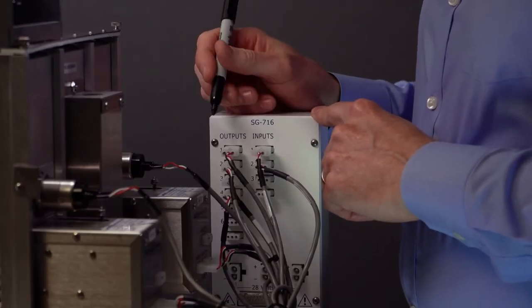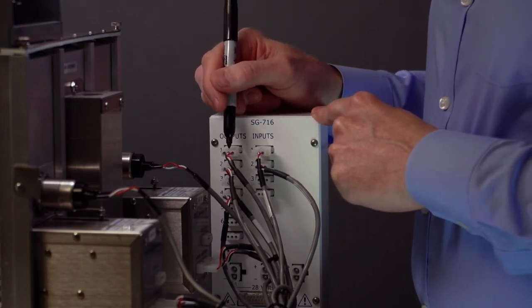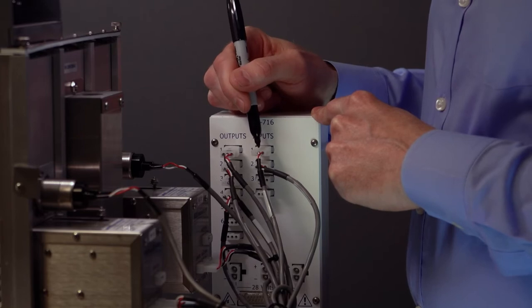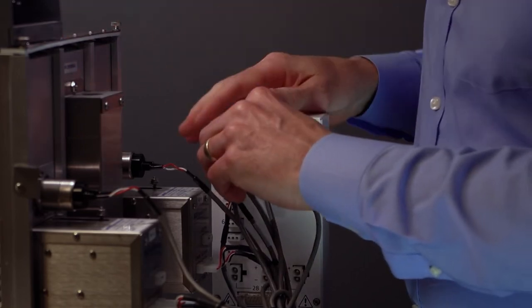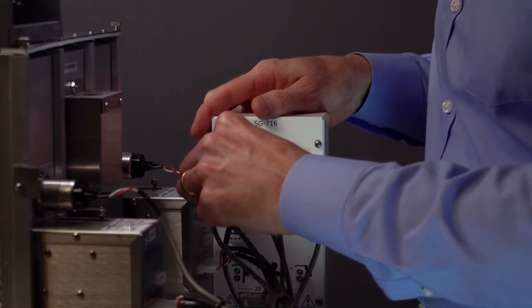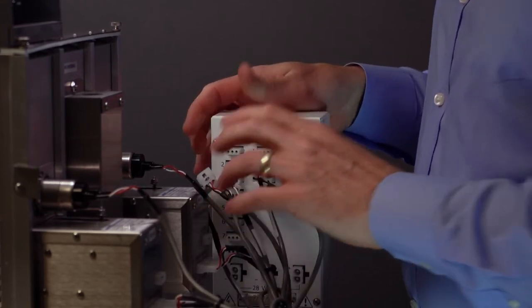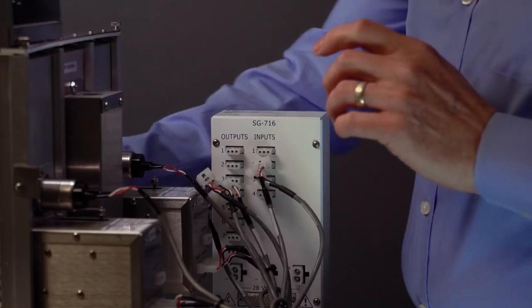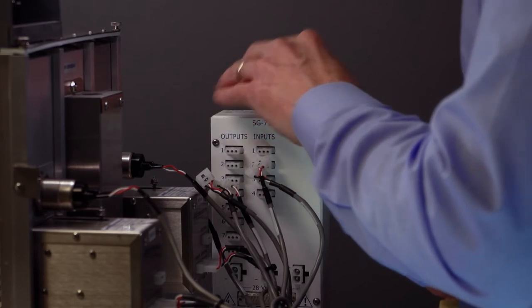Okay, now let's talk about converting the MedAssociates box using the ANY-maze Operant Interface. The first step is going to be to remove the connectors. Before doing so, it's a good idea to mark your outputs and inputs. You'll see why that's important a little later. Once your connectors are disconnected, you can remove the old box and replace it with the ANY-maze interface.